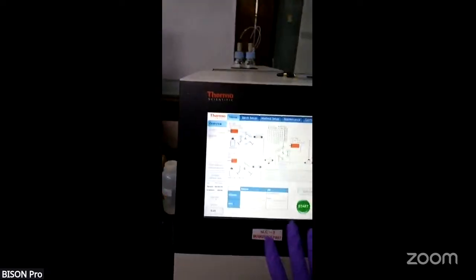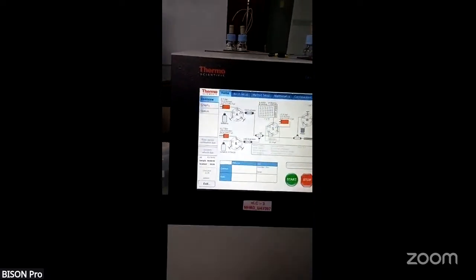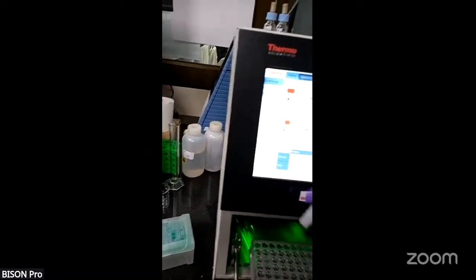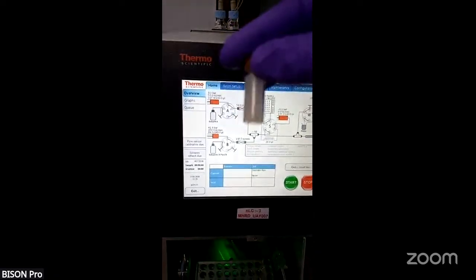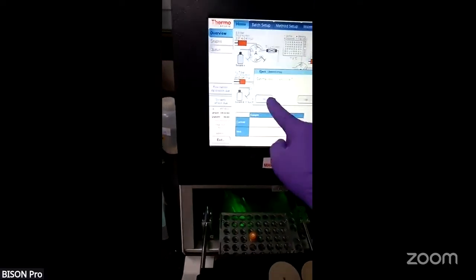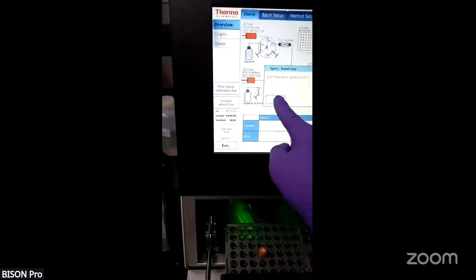There is a demo version of the nano LC, where I am going to show you how we can inject the tray out. So here is how the tray looks like. These are the solvents, these are the trays. You can inject the samples inside the tube. So after your peptides have been quantified, you can just inject the samples of the peptide here. At a stretch, you can easily go for 96 well samples.